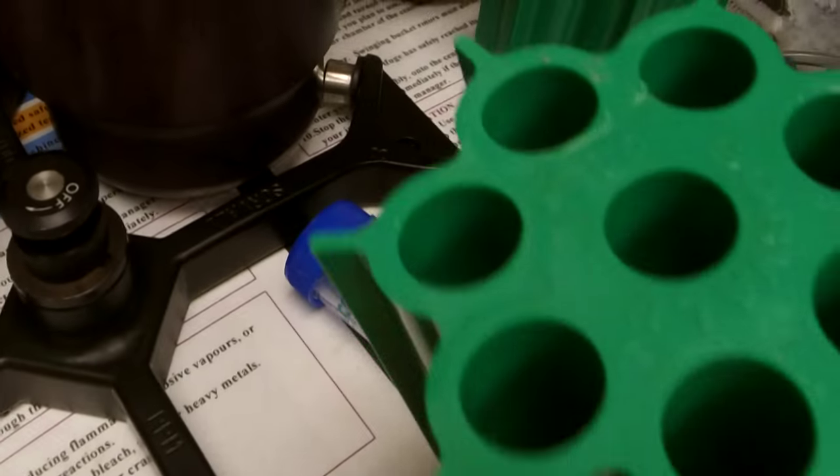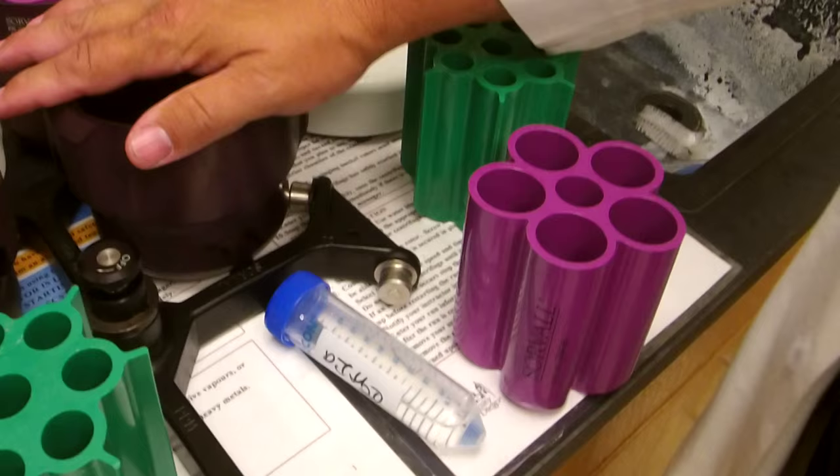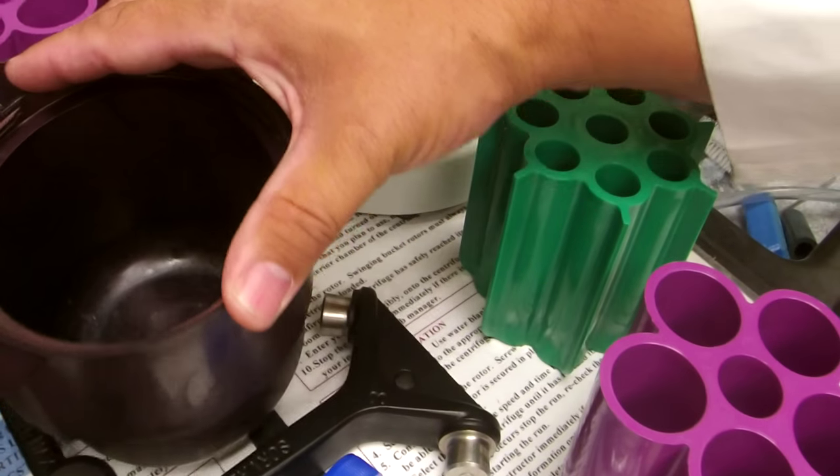You can also see here we have different inserts for the buckets, and there are centrifuge tubes that fit these large buckets and will hold about a liter volume.